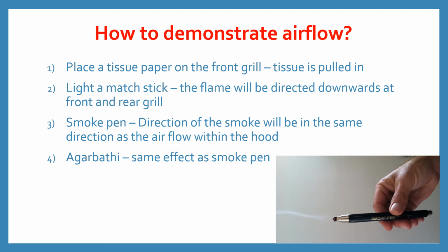2. Light a matchstick. The flame will be directed downwards at the front and rear grill. 3. A smoke pen. The direction of the smoke will be the same as the direction of the airflow within the hood. 4. Agarbatti. It has the same effect as a smoke pen.